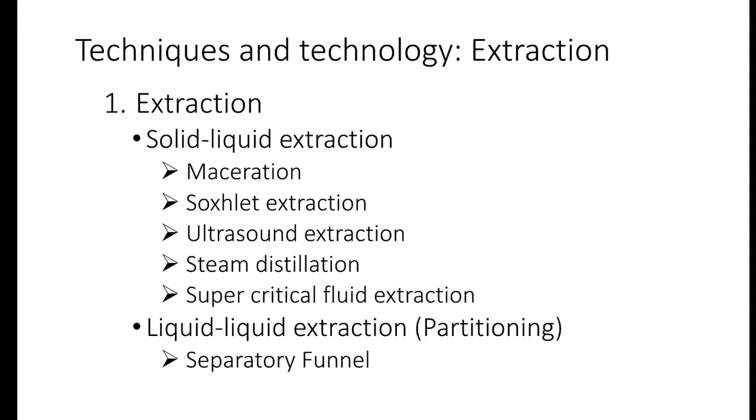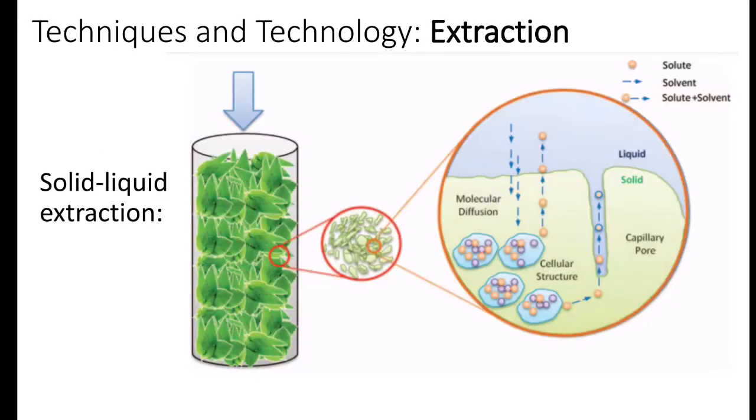Let's go to extraction techniques first. What we will discuss under extraction are solid-liquid extraction and liquid-liquid extraction. Okay, so let's start with solid-liquid extraction.